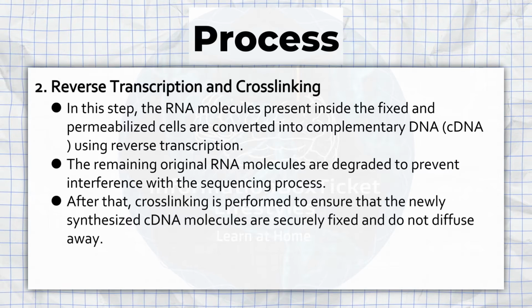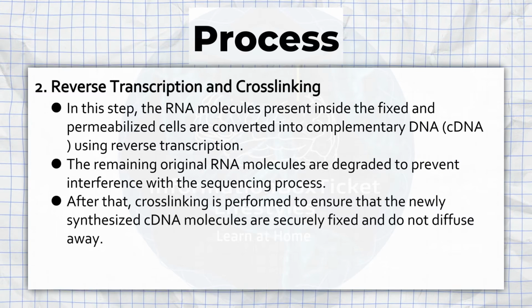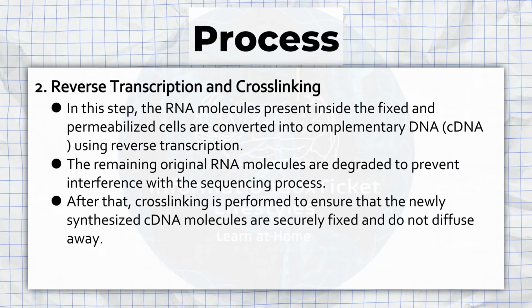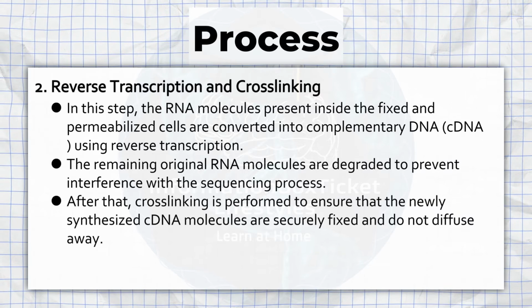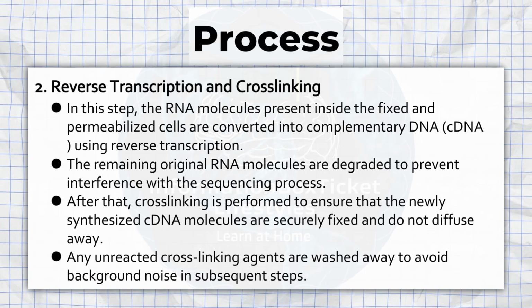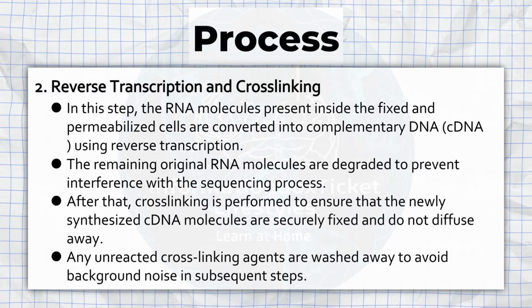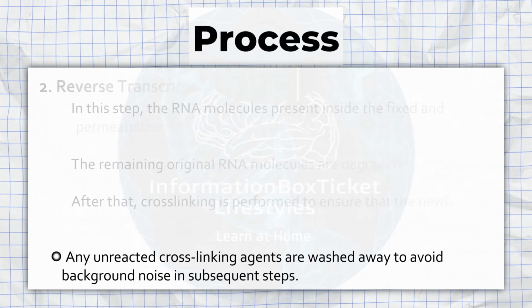After that, cross-linking is performed to ensure that the newly synthesized complementary DNA molecules are securely fixed and do not diffuse away. Any unreacted cross-linking agents are washed away to avoid background noise in subsequent steps.